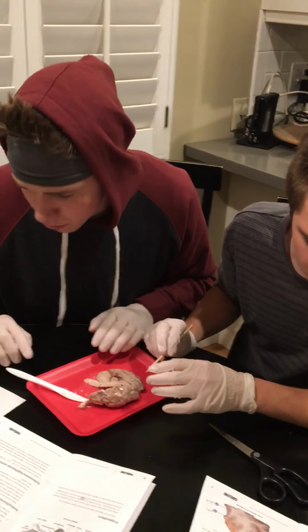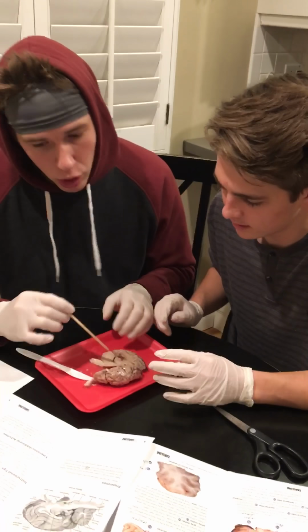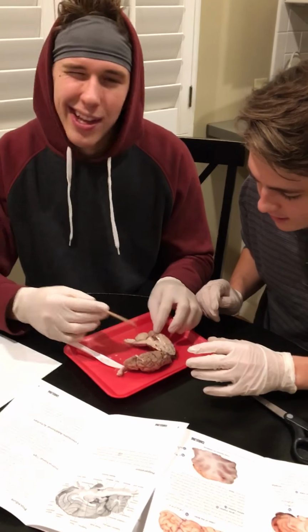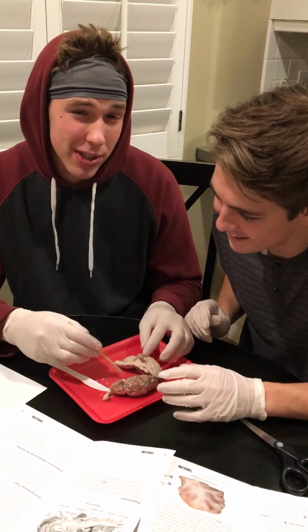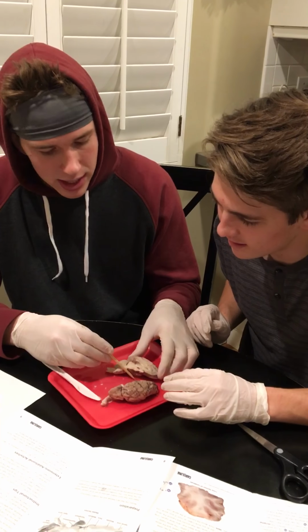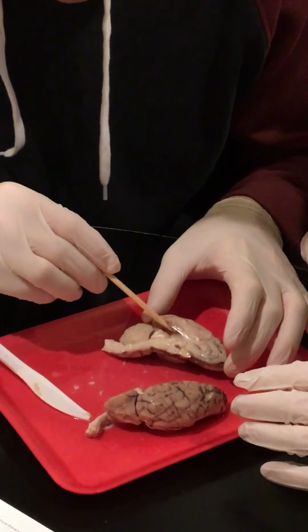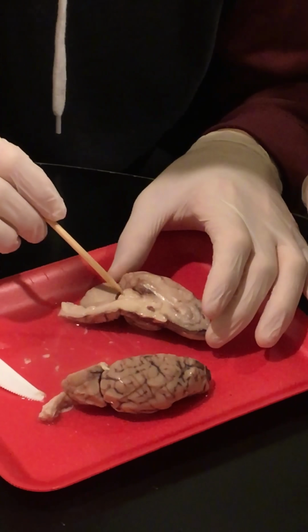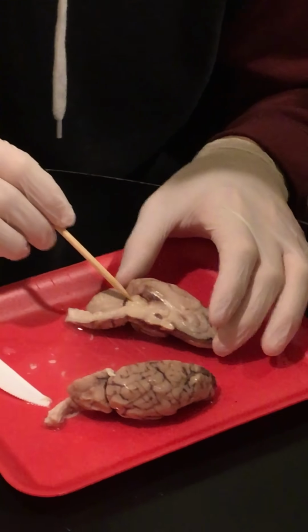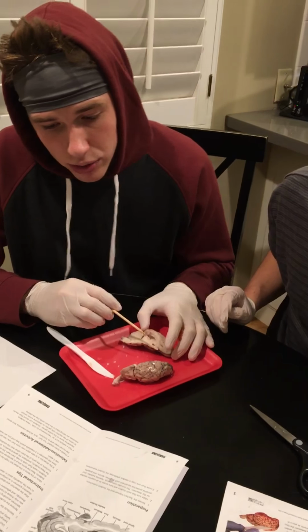Another thing we would like to discuss is the pineal gland. This is kind of your internal clock, sleep and whatnot, and has something to do with some of your sexual glands. This guy is going to be right there. You can see him. He's not very firm, but he's right there. That's your pineal gland.